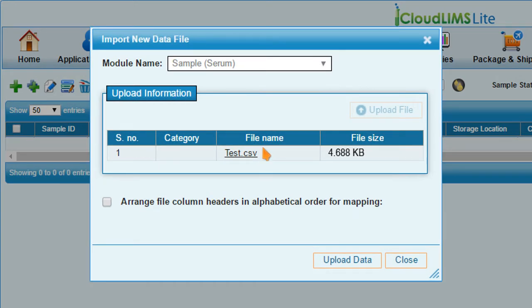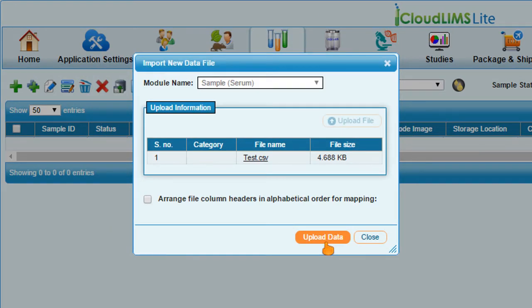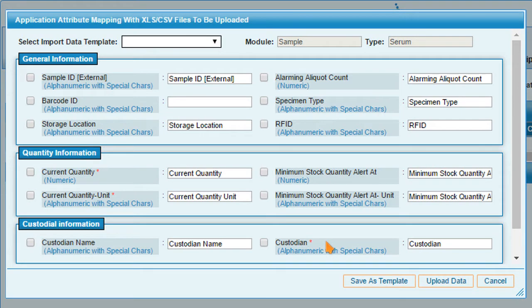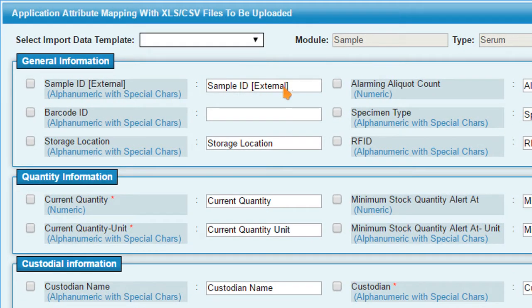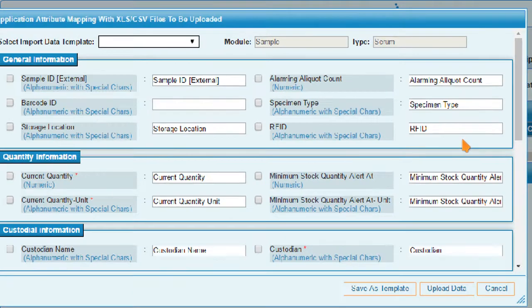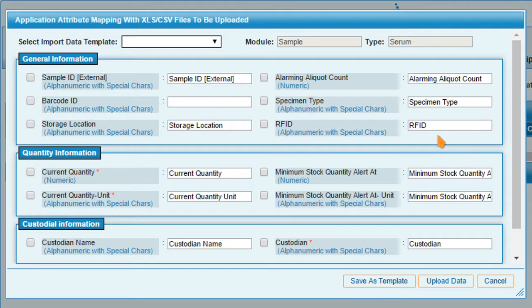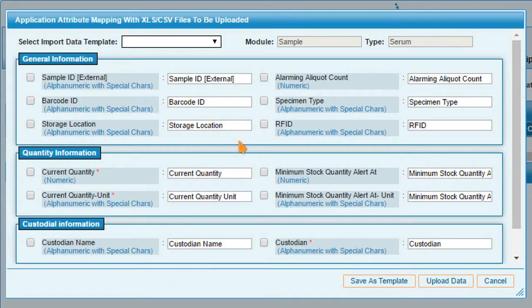After verifying the upload information, click on Upload Data. The Application Attribute window appears. CloudLimbs Lite automatically maps the header fields to attributes in the product. You can now manually map headers that have a different name to the already available attributes.